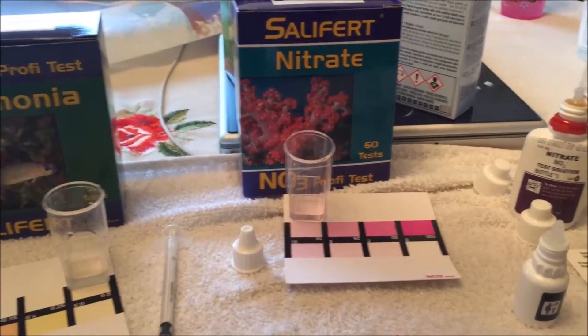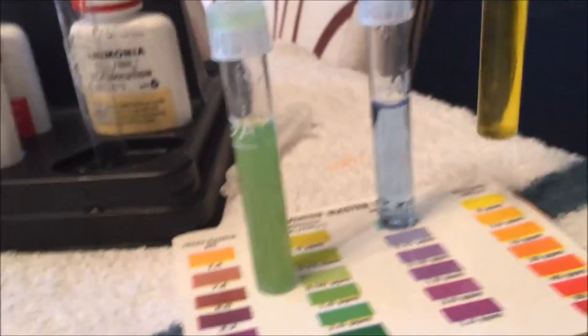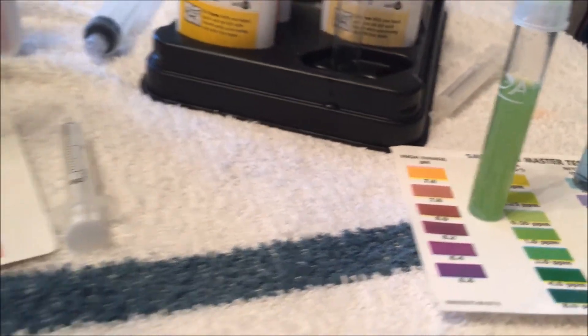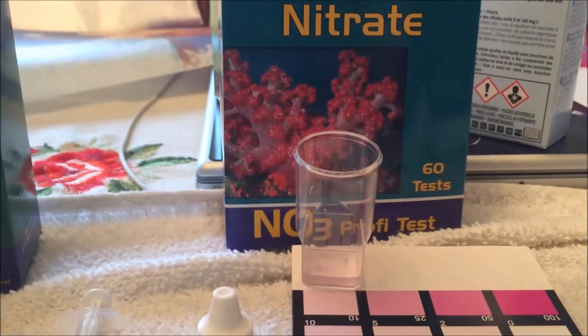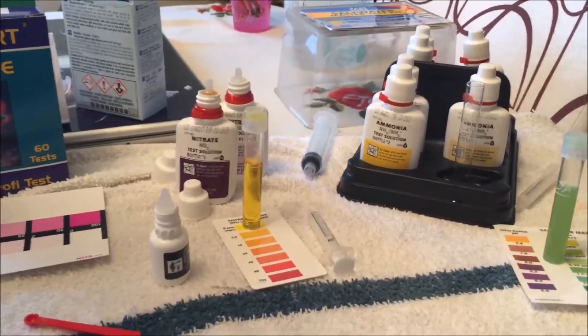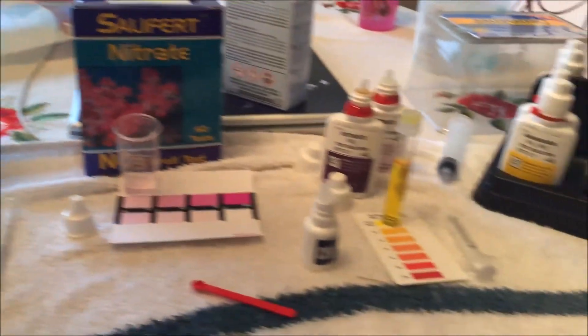In conclusion, I'll leave it up to you, but here is your API nitrates: zero ppm. Here's your API ammonia: about 0.50. And here's Salifert nitrates and ammonia. I hope this helped - you make your own decisions, but as far as I'm concerned, I'm going to stick with Salifert. Have a good one guys.